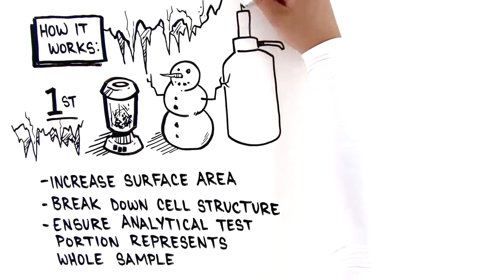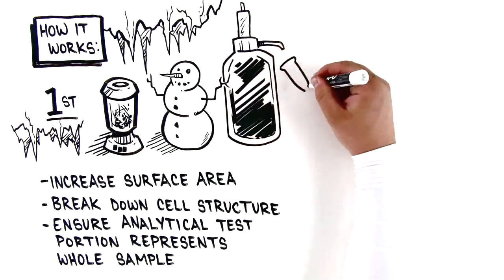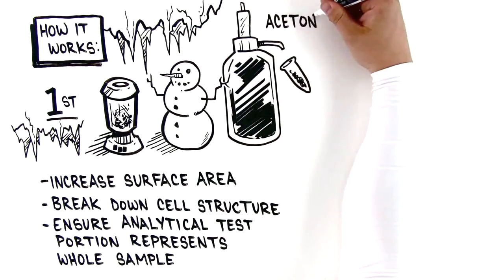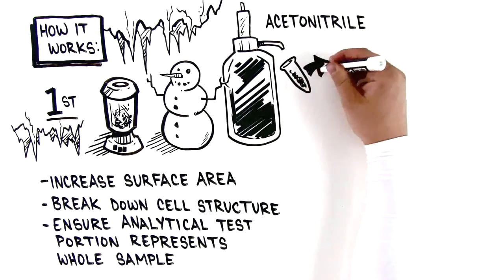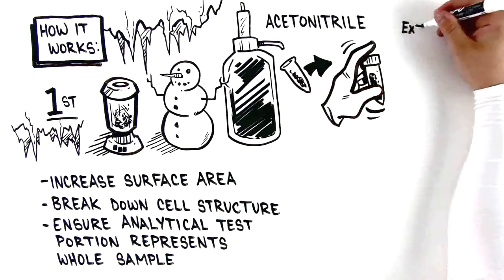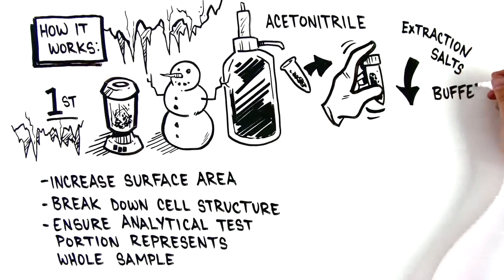Next, add the internal standard and the extraction solvent, typically acetonitrile, into the centrifuge tube with your sample. Shake vigorously, then add the extraction salts and buffers, and shake again.